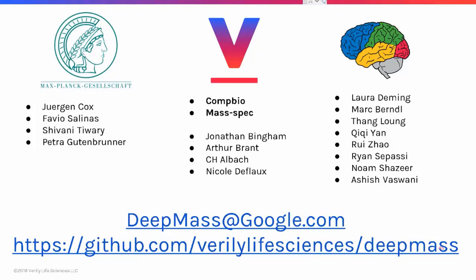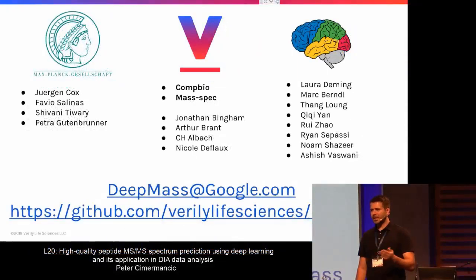If you are interested in giving this tool a try, you can join this Google group or read more about how to use it at this URL. I warn you, it's not going to have a graphical interface. It's going to run through the command line, but hopefully that's not going to be too difficult.